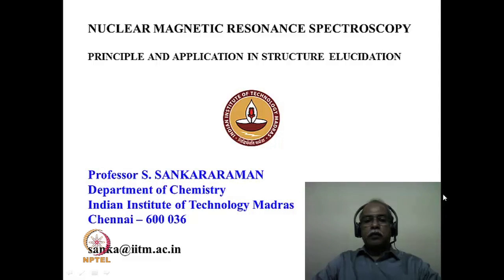Hello, welcome to Module 4 of the course on application of spectroscopic methods in molecular structure determination. In this module, we will continue with NMR spectroscopy and we will actually see some NMR spectra of very simple organic compounds. We'll try to interpret the spectrum of these compounds and see whether we can familiarize ourselves with the chemical shift and the coupling constant values.